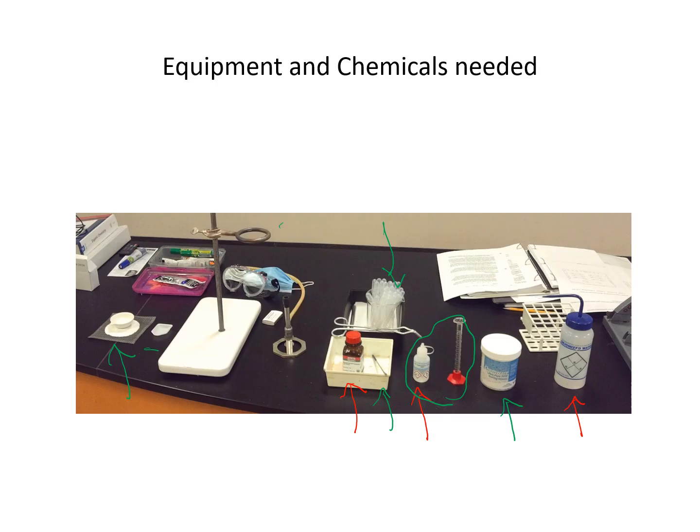You'll need a ring stand with a 2-inch metal ring clamped onto it. You'll have your Bunsen burner as well. Here's your matches to light your Bunsen burner. This is your personal protection, your face mask, and your goggles.